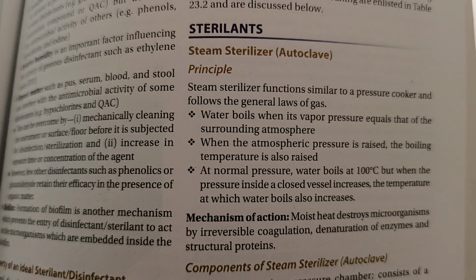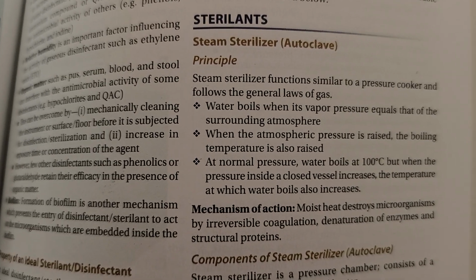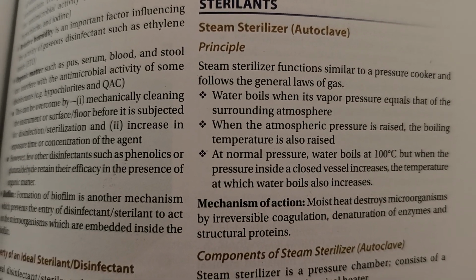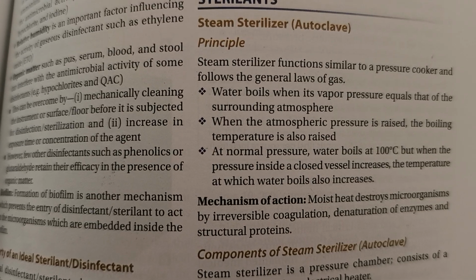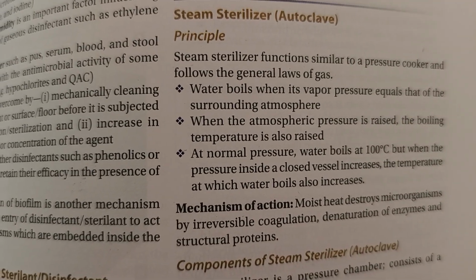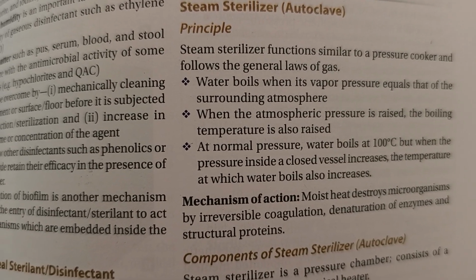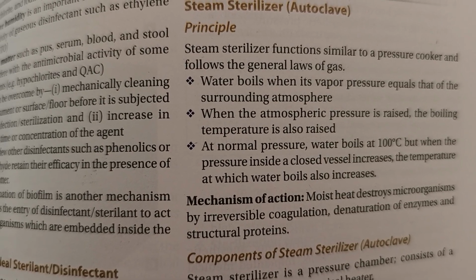Sterilants. Steam sterilizer, autoclave. Note that autoclave is an important question in the university exams. So what is the principle of steam sterilizer? Steam sterilizer functions similar to the pressure cooker and follows the general laws of gas. Water boils when its vapor pressure equals that of the surrounding atmosphere.